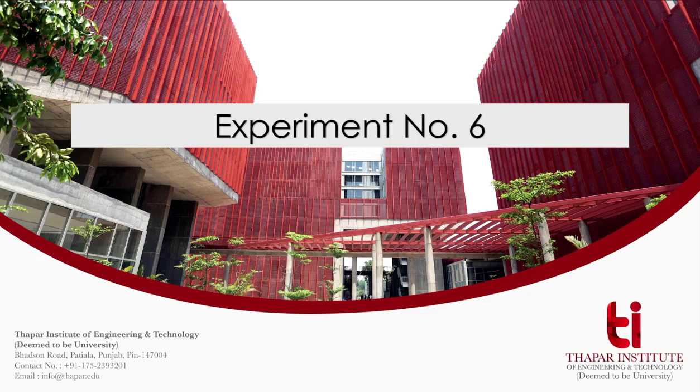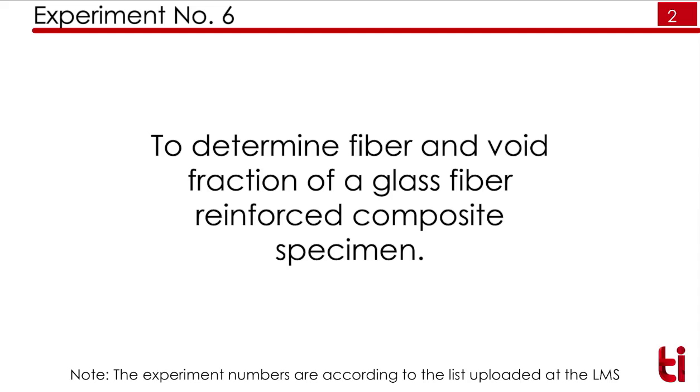Hello students, in this lecture we will see experiment number 6, entitled to determine the fiber and void fraction of a given glass fiber reinforced composite sample. Here you have to remember that these experiment numbers are according to the list that is uploaded on the LMS.